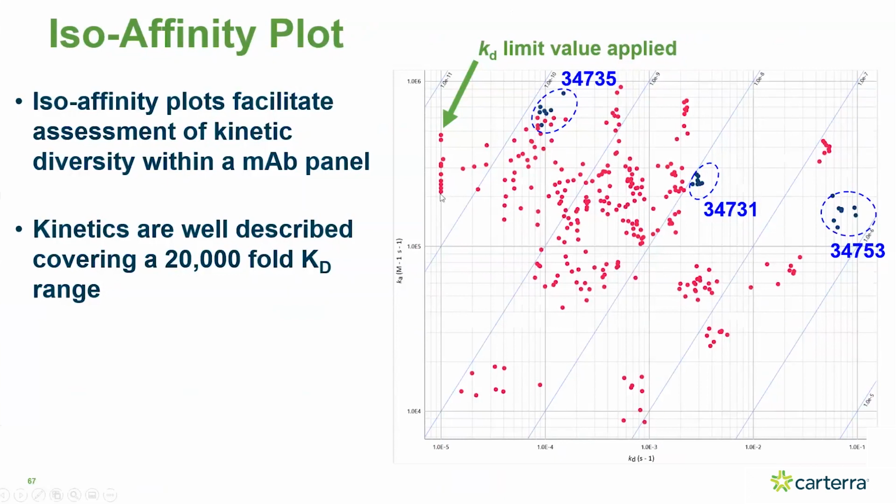So it could say you have an off rate of 1 × 10⁻⁹ or something, even though it's just essentially measuring nothing, but the residuals wouldn't change, so the fit wouldn't know any better. So we have to give it some constraints to operate in. And unfortunately, there's examples in the literature where software will fit it that way, and people have reported some relatively high affinity clones, let's say, based on those erroneous fittings.